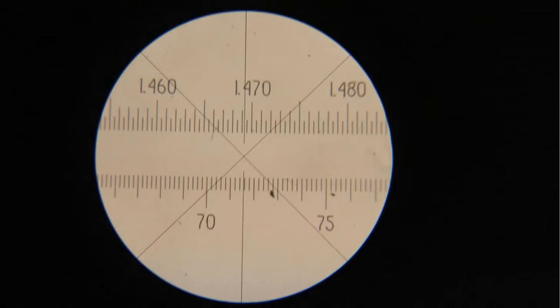I align it up to the center. This is the view field. This is what I see. And then when I flip the button down, here's the meter. So you can write down your readout for the refractive index the way that you need to.